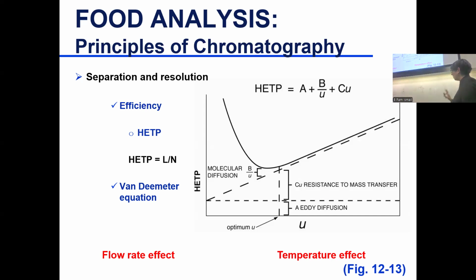But okay, so temperature is important because sometimes we increase the temperature, like those of you that did HPLC, we ran it, was it at 35 degrees C? Can't remember, but a little elevated over the room temperature. That helps with reaching equilibrium faster and with the transfer factor. So the transfer factor becomes smaller at higher temperature, helps reducing the height equivalent of theoretical plate.